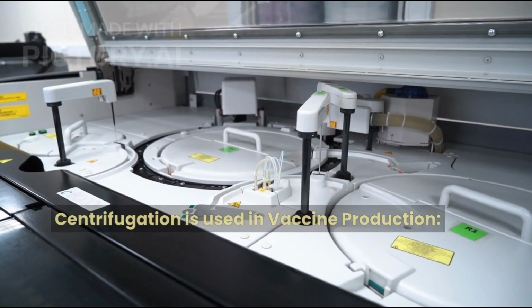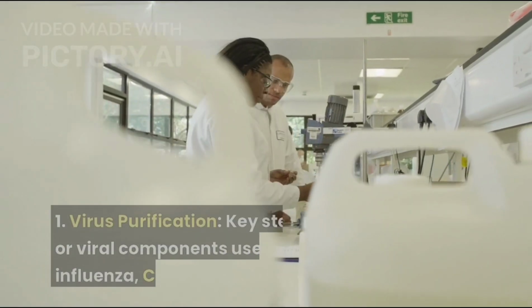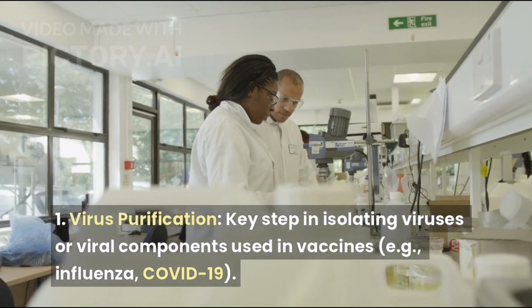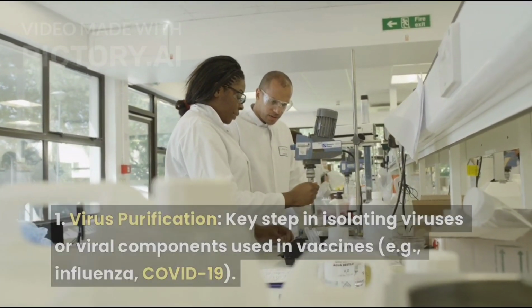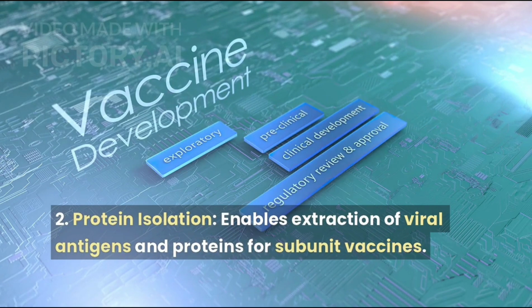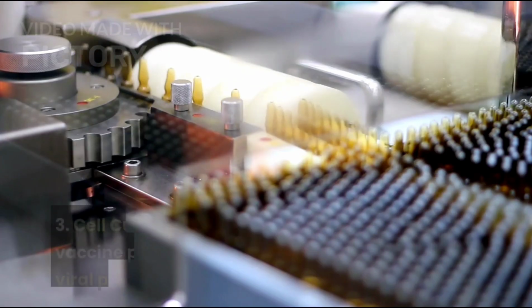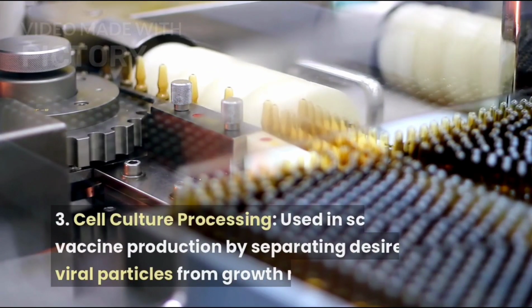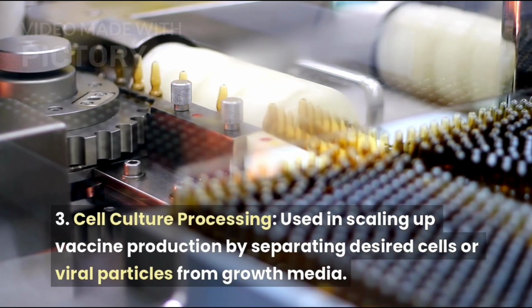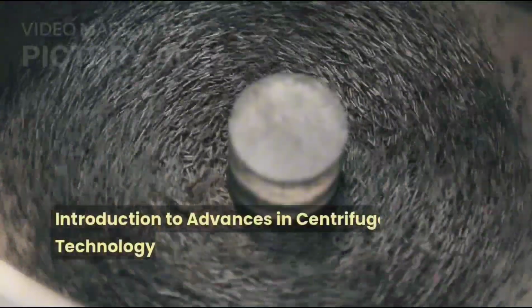Centrifugation is used in vaccine production. Number 1, virus purification, a key step in isolating viruses or viral components used in vaccines, for example, influenza, COVID-19. Number 2, protein isolation, enables extraction of viral antigens and proteins for subunit vaccines. Number 3, cell culture processing, used in scaling up vaccine production by separating desired cells or viral particles from growth media. Introduction to advances in centrifugal technologies.